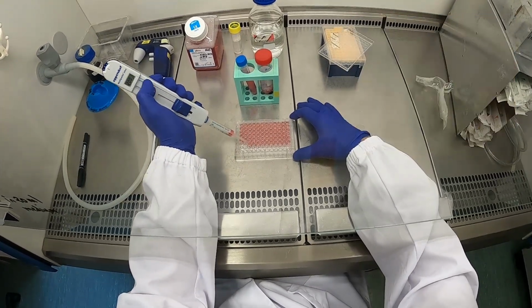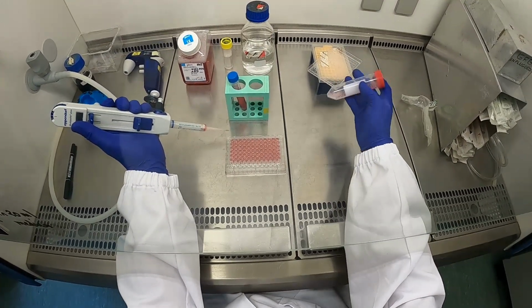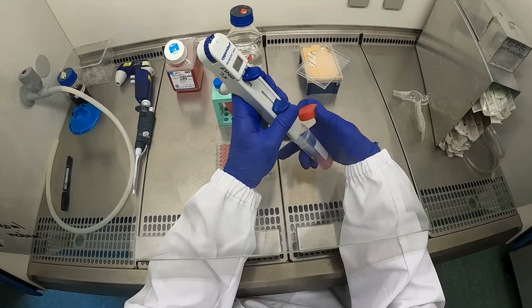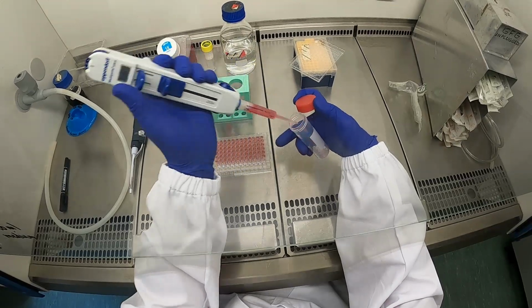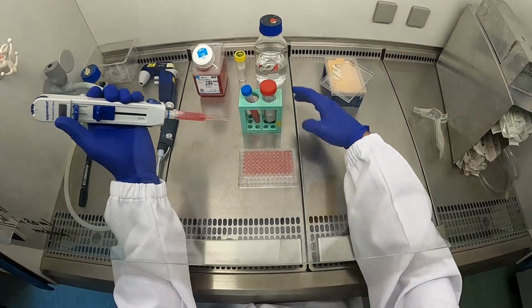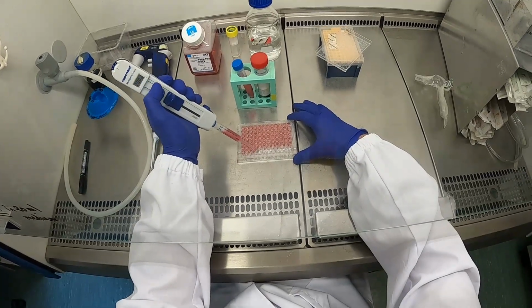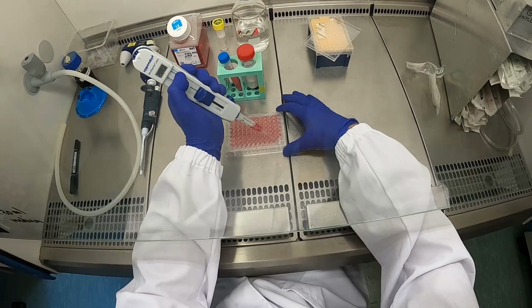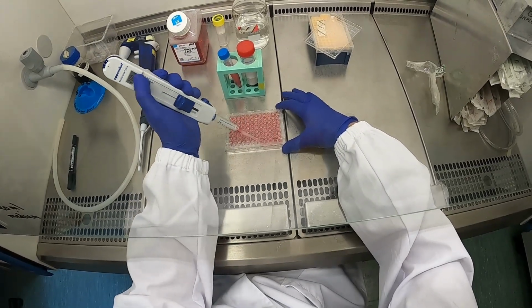Boring! Yes, indeed, this can get a little bit boring, so sometimes when no one is around, you start to race with yourself, see how fast you can fill those wells, and this often ends with cells splattering all over the place. However, we are reaching the end of the plate, which means we're almost ready to go home.